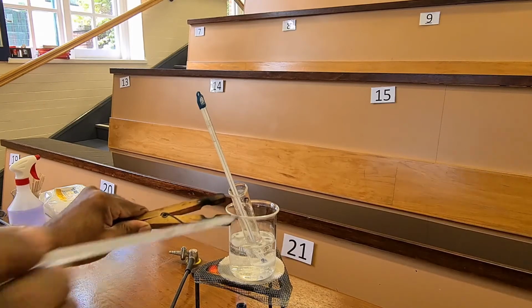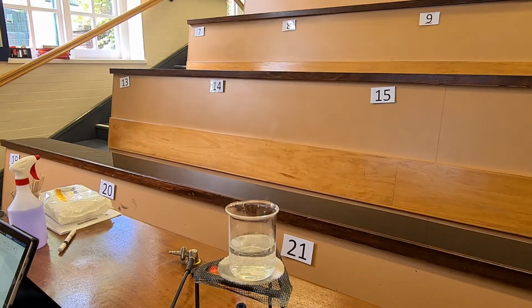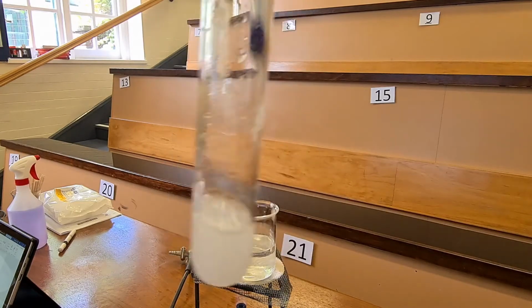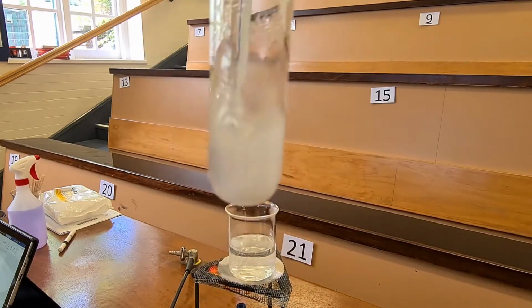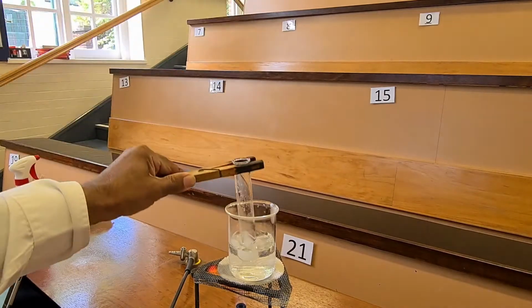And finally, let's pick up D. Now that was what was in there earlier. Stirring it up, get any solid down into the solution, getting it to dissolve, not dissolving yet.